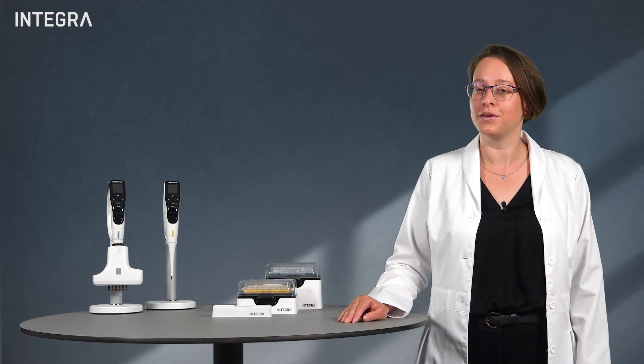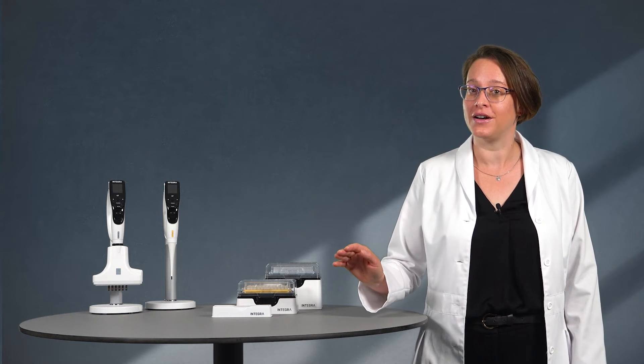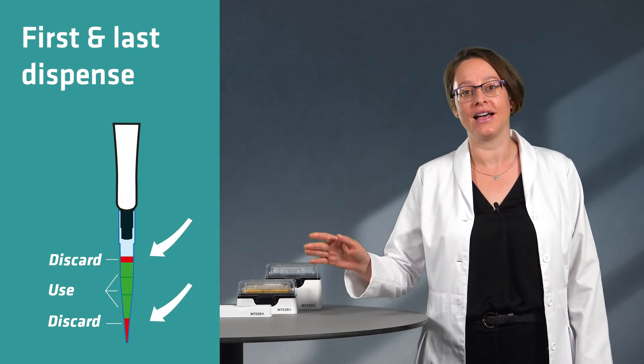However, to achieve the best results when performing a repeat dispense, follow this simple rule: always discard the first and the last dispense.